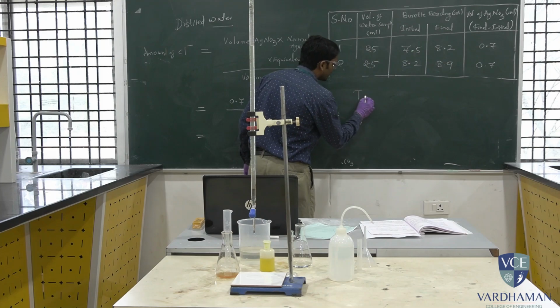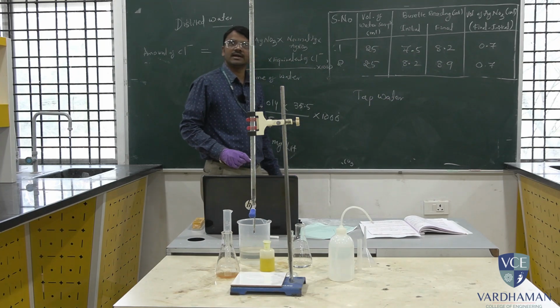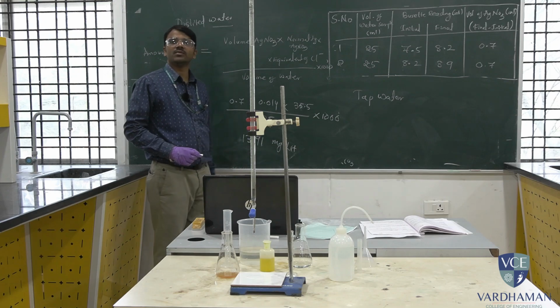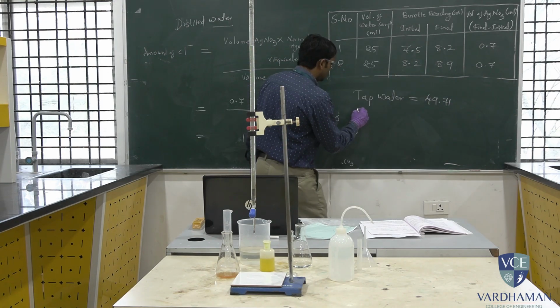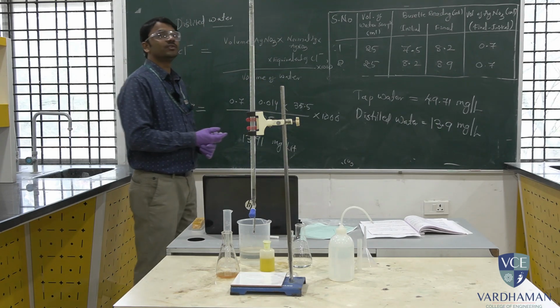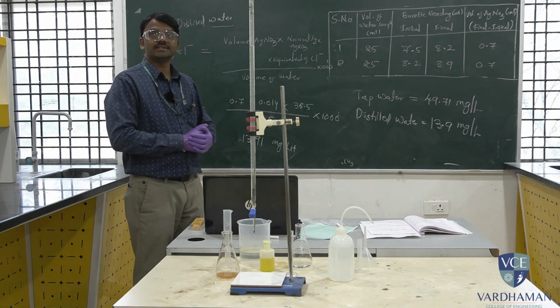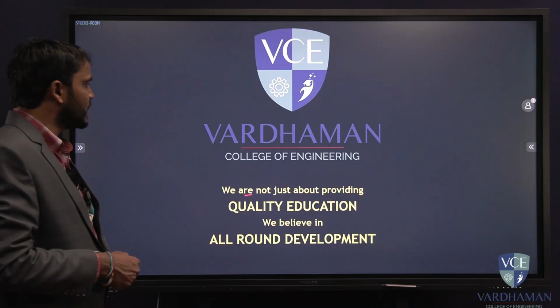In the tap water case, tap water contains more chloride content as compared to distilled water. Tap water gave 49.7 and distilled water this much, 13.9. So this is the way we need to conduct the argentometric titration to find the concentration of chloride ion present in the water. So thank you everyone.